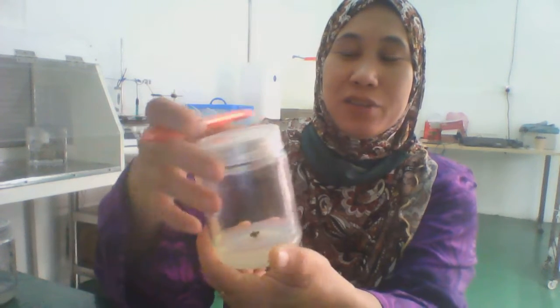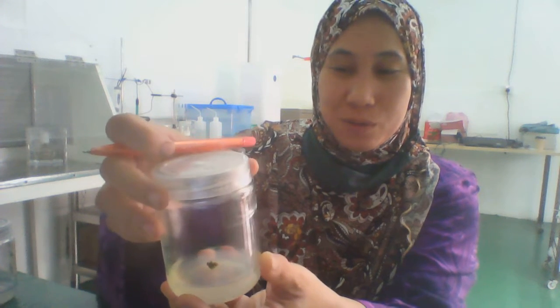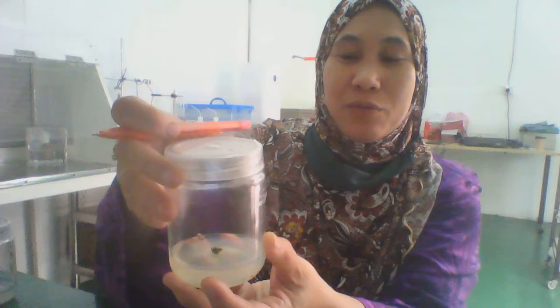And this one I try to put into MS plus 5 BAP also, but then I will keep on monitoring the growth and see if it's stagnant or the growth is really slow. I might change it into a different media. This is the experiment for me. This is caladium Miss Muffet.